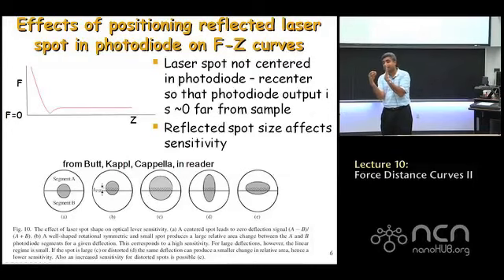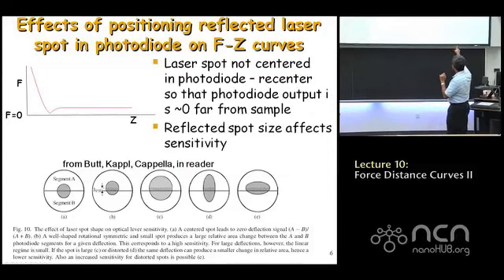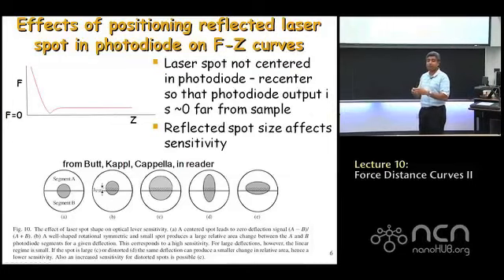Let's say the cantilever bends by a certain amount, right? So the center of the reflected spot is going to move up by a certain amount. That little amount by which it moves up is shown in B, C, D, E by the hatched area. That's the upwards motion of the center of the reflected spot. And it is the same in B, C, D, E, because we're simply comparing, for the same deflection, what is the signal you're going to get out of the photodiode depending on the spot size.